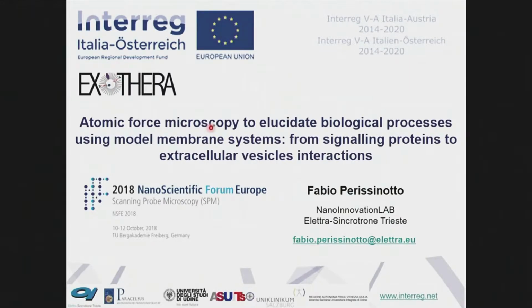Today, I will talk about two atomic force microscopy applications that involve the use of artificial lipid bilayers for studying the interaction of proteins, molecules, or structures like extracellular vesicles with this kind of system. We are mainly an atomic force microscopy laboratory for biological applications.